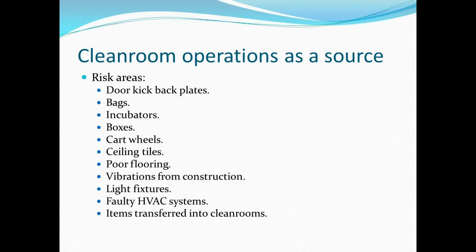Also vibrations from construction. There have been some cases where work has been taking place in one part of the building, not necessarily even in the clean room, but the vibrations through the building structure cause fungi to be dislodged into a clean room. Faulty light fixtures, problems with HVAC systems, say a hole in a HEPA filter or leakage around the HEPA filter housing, and with items going in and out of clean rooms.